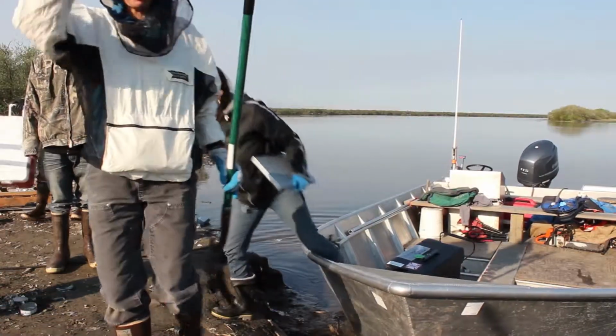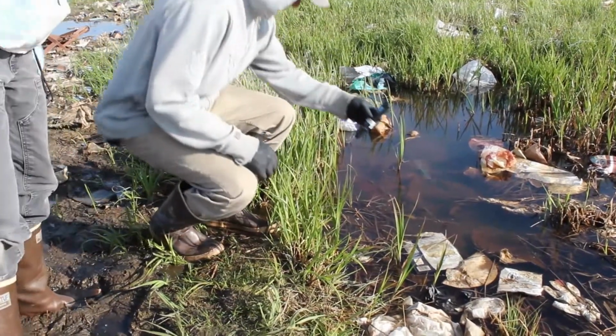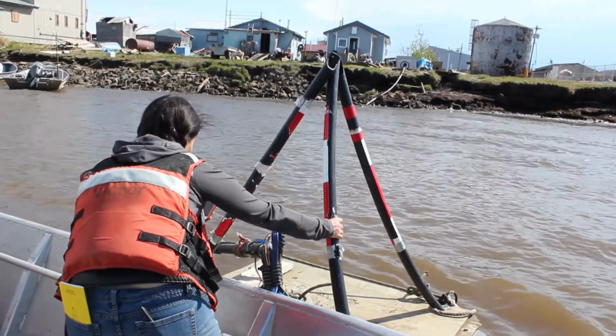In this video, we will be demonstrating water sampling techniques when taking water samples at a landfill and grabbing a sample from open waters.